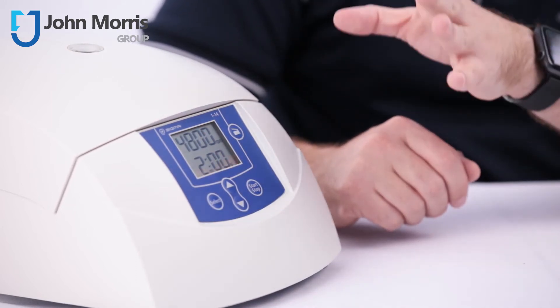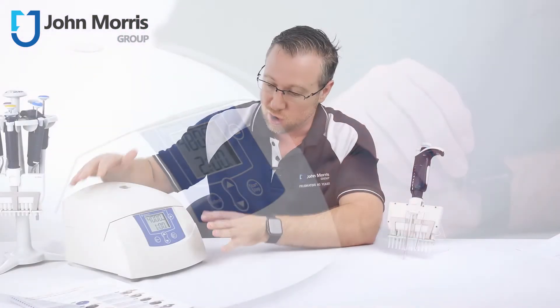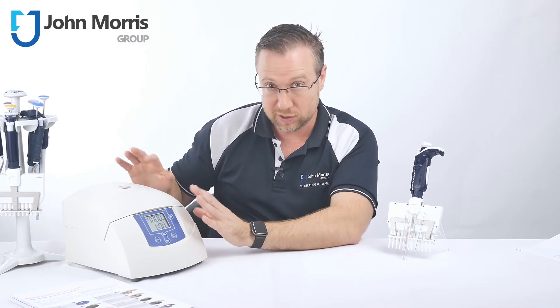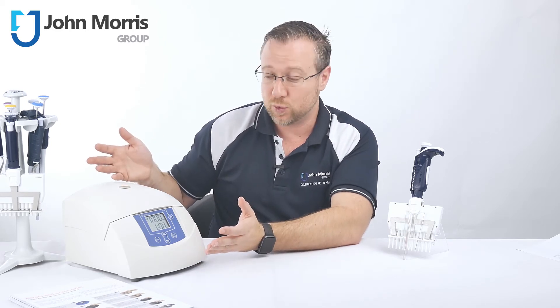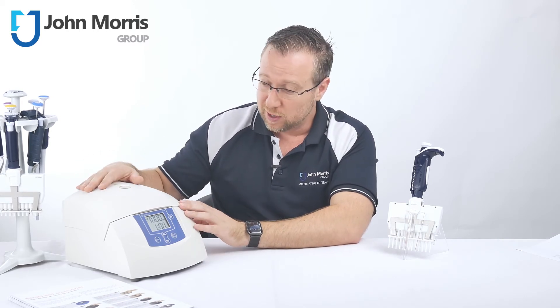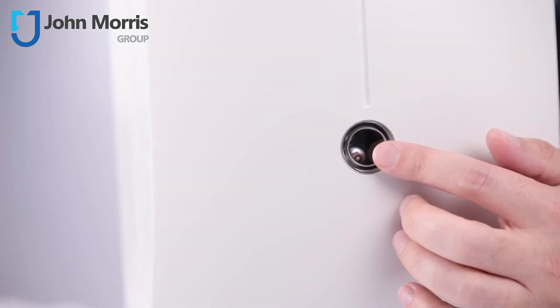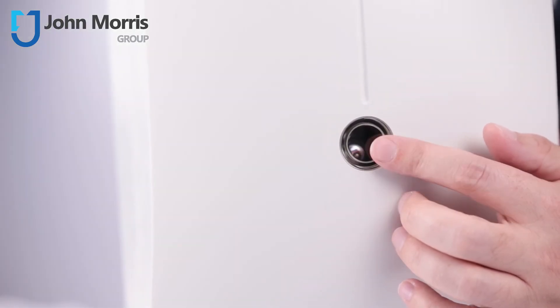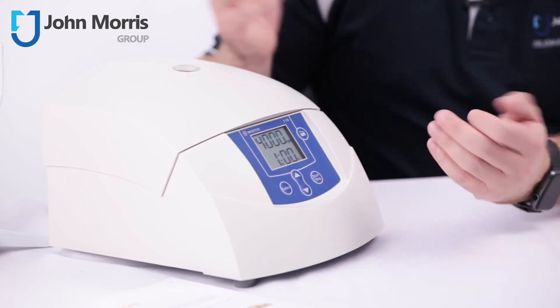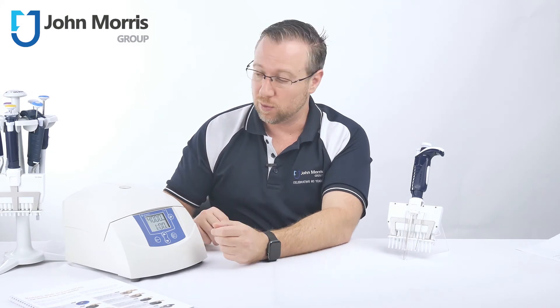When you're finished with a run, once it's come to a standstill, the lid will nicely open slightly so you're ready to begin again. It's a really compact centrifuge but has a reasonable amount of mass — six kilograms in weight. The non-refrigerated version only takes about 95 watts when running, so it's relatively energy efficient. It won't take up a lot of space on your bench, and the surfaces are very easy to clean. There's a nice viewing window on top so you can see exactly what's happening — whether the rotor is running or stationary — which can come in handy if you get a power failure or something unusual is happening with your power.